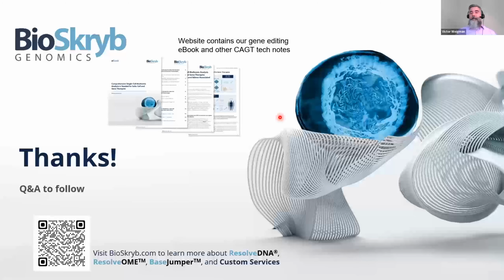project, confirm, and refute your mechanism of action of that edit, I think understanding the whole genome picture is a vital and necessary step to really rest at ease that we cover the whole genome, we're qualifying everything that we can, we're pointing back to the functional events, and as far as science allows, we're doing our due diligence to ensure the safety of potential individuals on these edits.